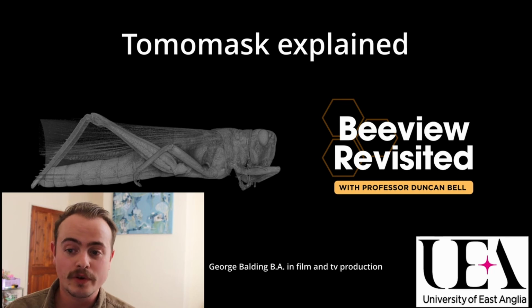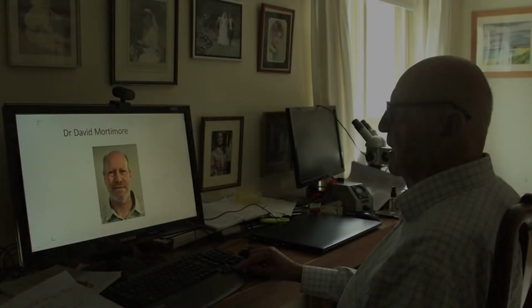Duncan will now walk you through how this essential tool works and explain why it is so important in analysing our micro-CT scan data. Duncan will show you one of the features, but through other videos you'll see other features that are available.